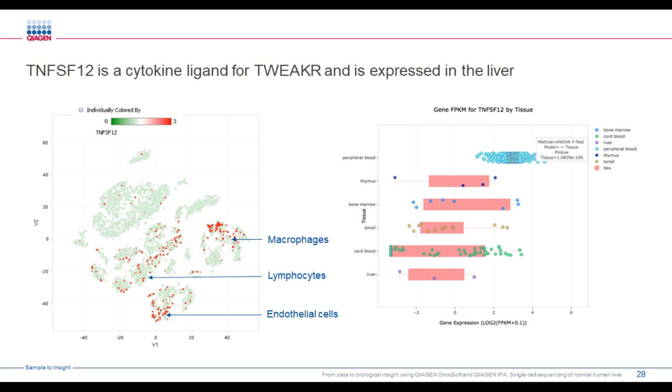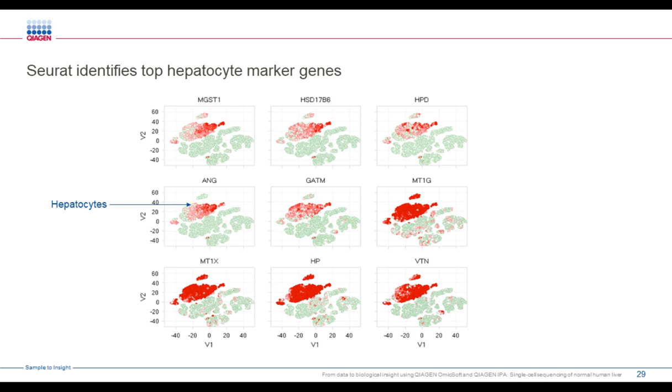And you can tell in one click that gene is expressed big time in peripheral blood, and you see other tissues, much less in the liver. This is a log2 transform. So that information from the scatter color views, you can actually expand that and understand what is the expression of that gene in other tissues using the link from IPA to Land Explorer. It's very easy to do.